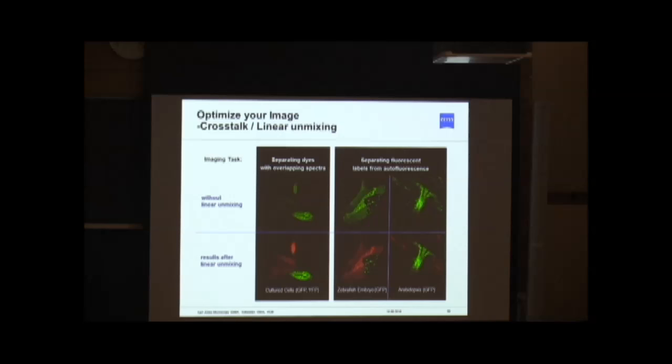And the nice thing is you can separate dyes with overlapping emission or excitation spectra, or for instance, you can also separate fluorescent labels from autofluorescence.